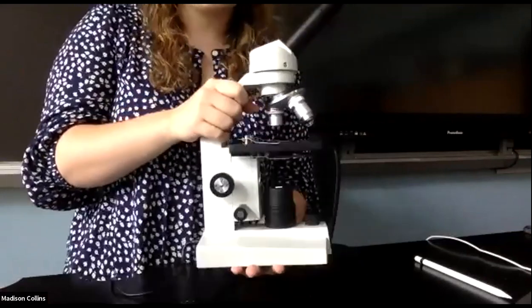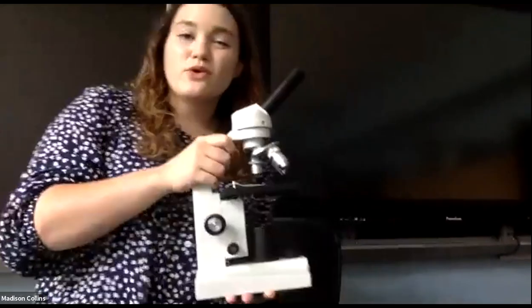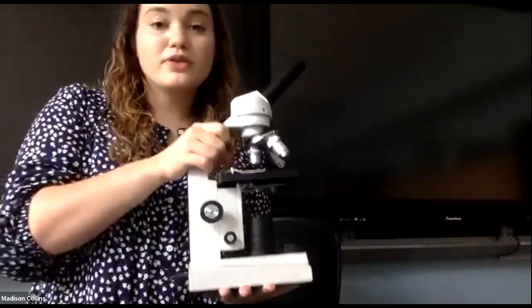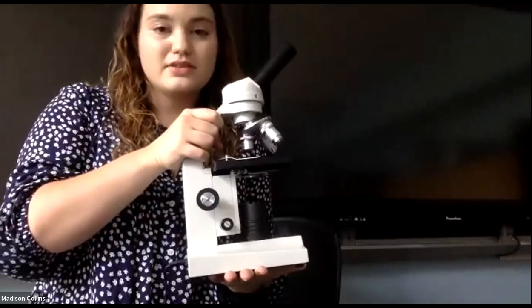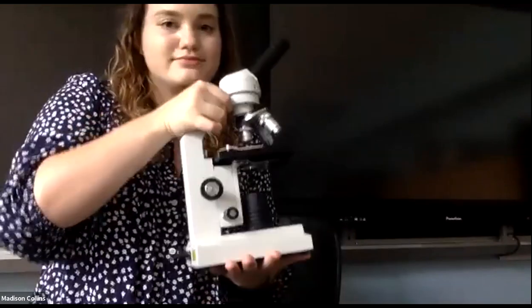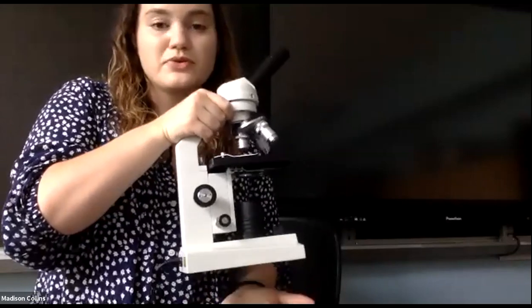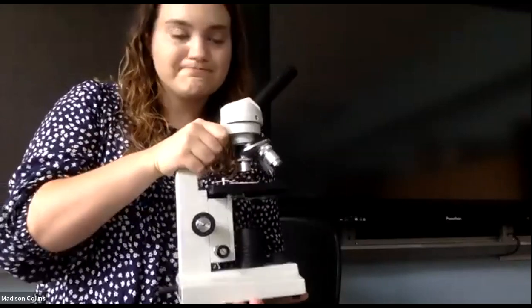And whenever we hold a microscope, just realized you can't see my face, I'm sorry. Whenever we hold a microscope, we want to make sure that we hold both the arm and the base. We never hold a microscope like this in lab, because if you drop it, it's super expensive. So make sure that when you hold a microscope, you use both the base and the arm.